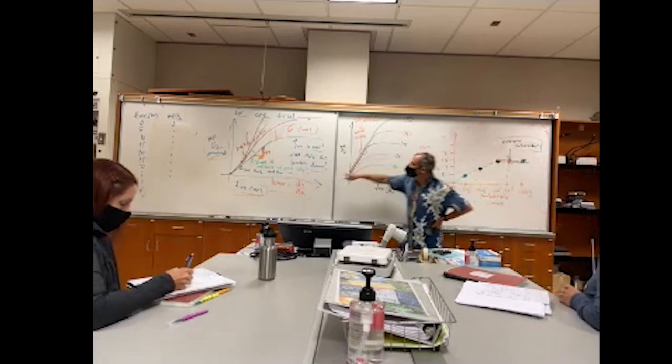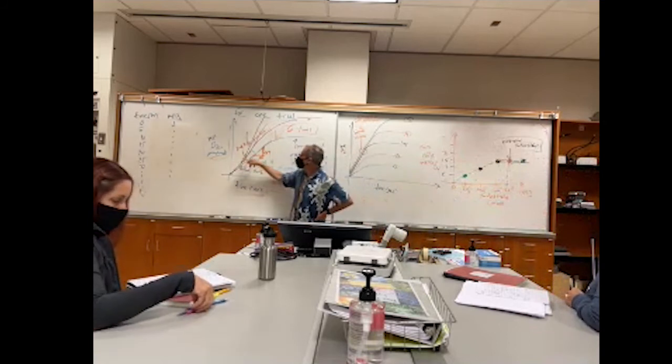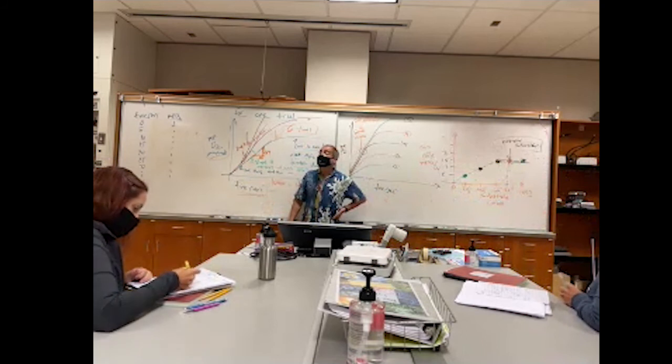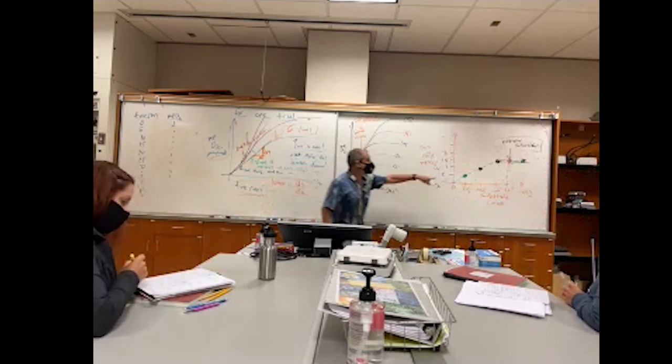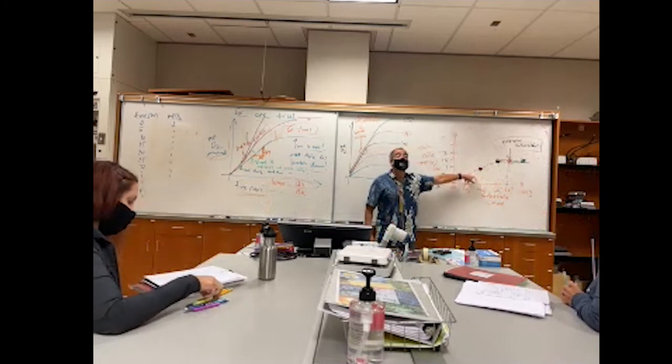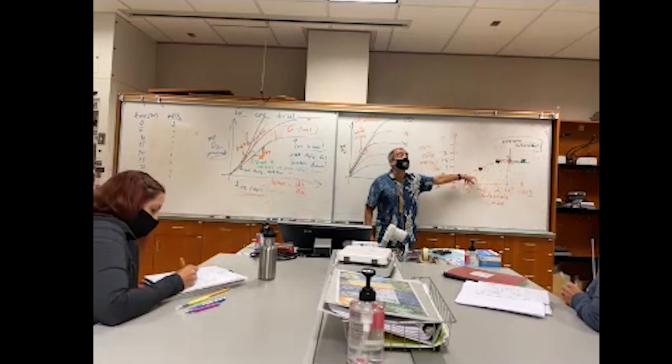Each of these time versus oxygen plots is something you are going to have to graphically calculate the slope from, which then gives you the numbers you need to make this graph, which is the graph that's actually going to answer your objective.